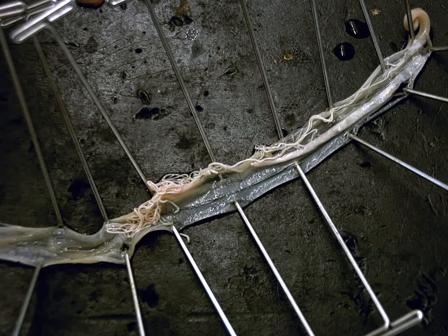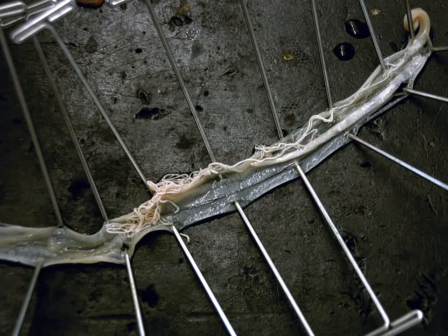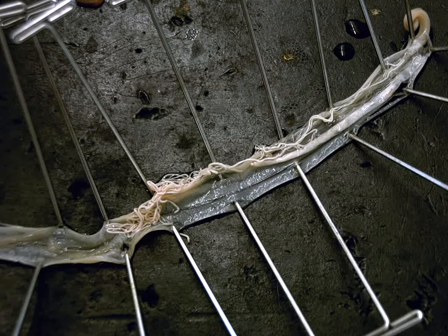All right, so what we have here is a male Ascaris worm, a parasitic worm that lives in the intestine.